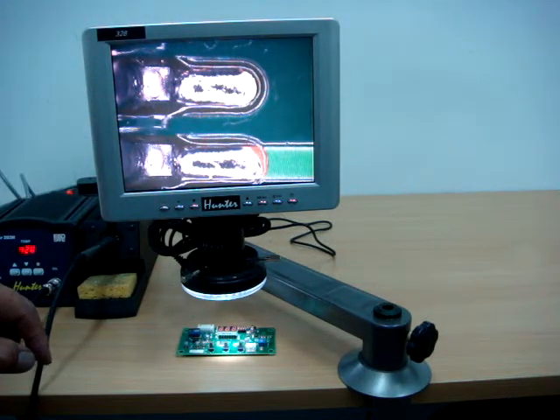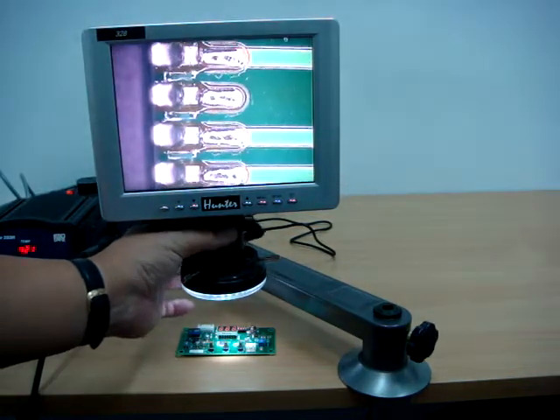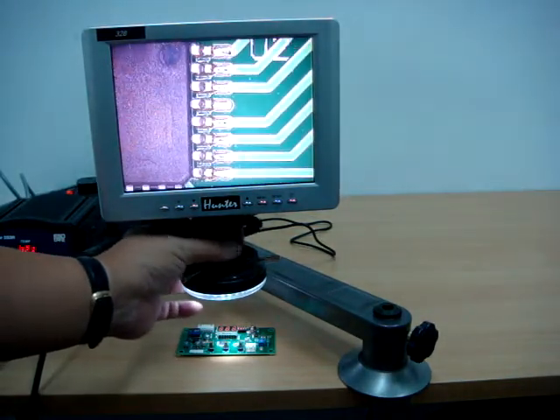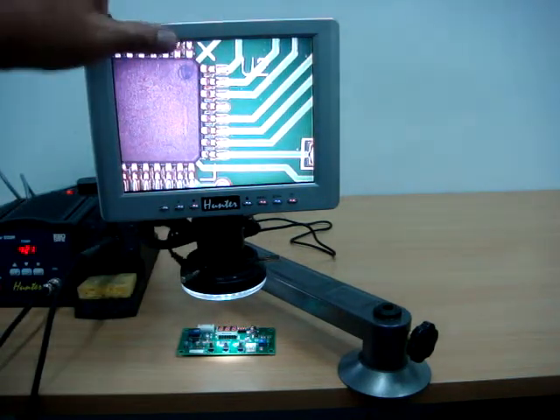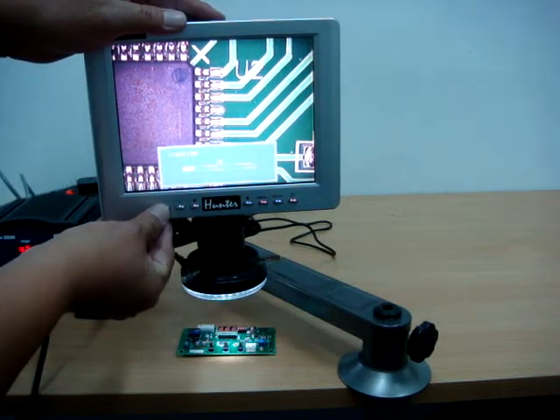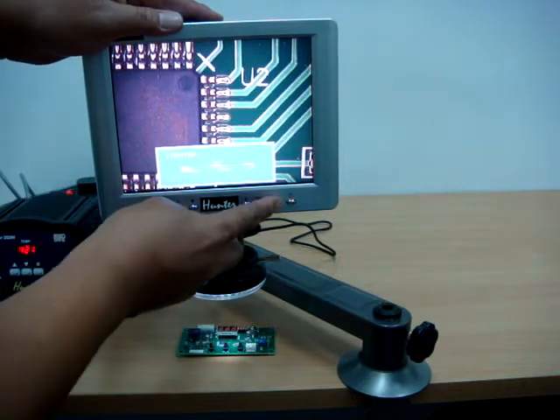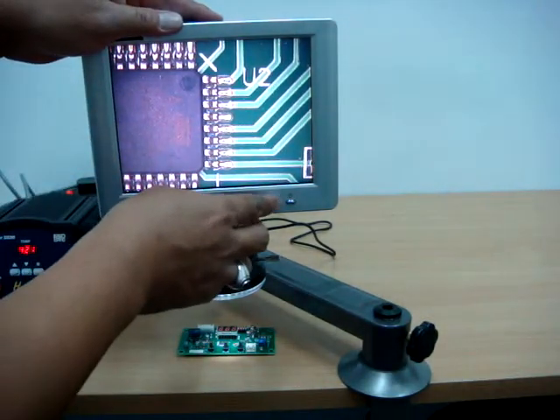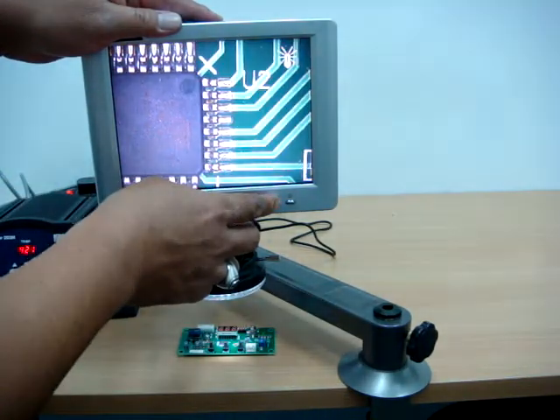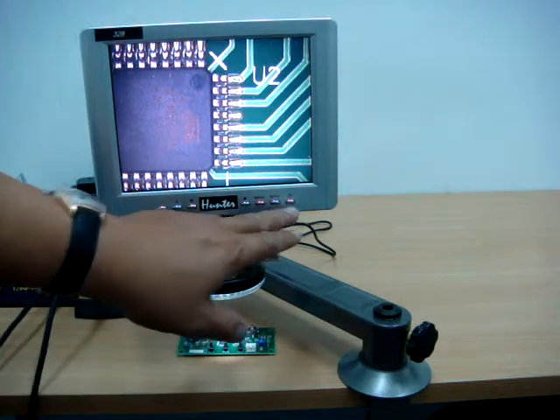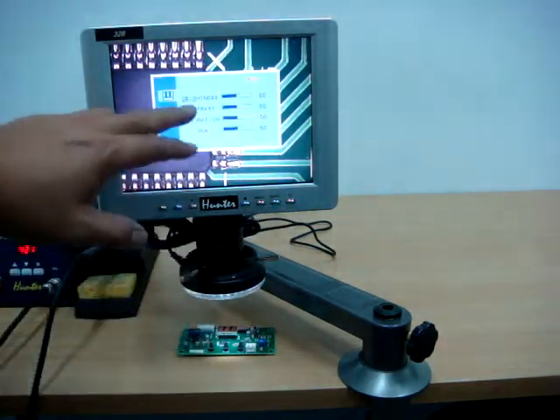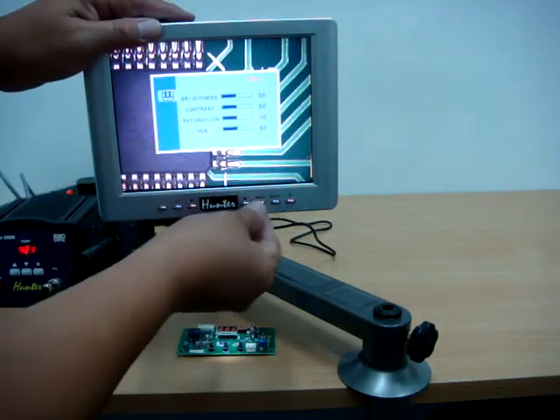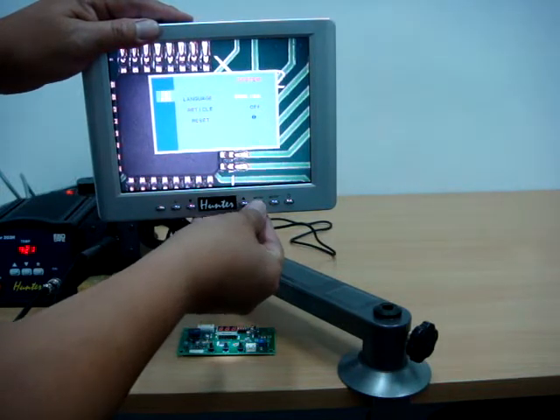This will be the reduced size going to the minimum of 10 times. If you find it's too bright, you can adjust the brightness from here to suit your eyes, and you can even turn it off without light. This is the on/off button, and this is the menu where you can adjust the brightness and the distance.